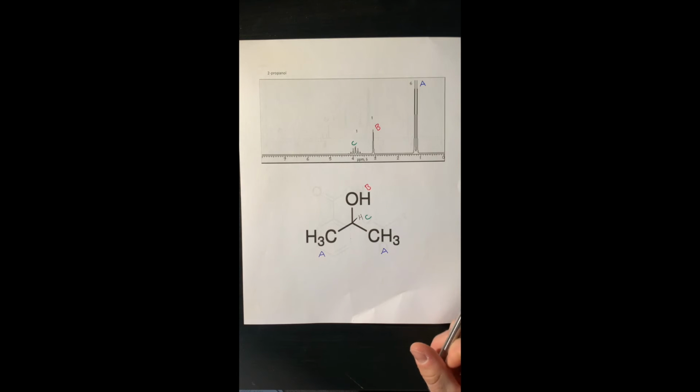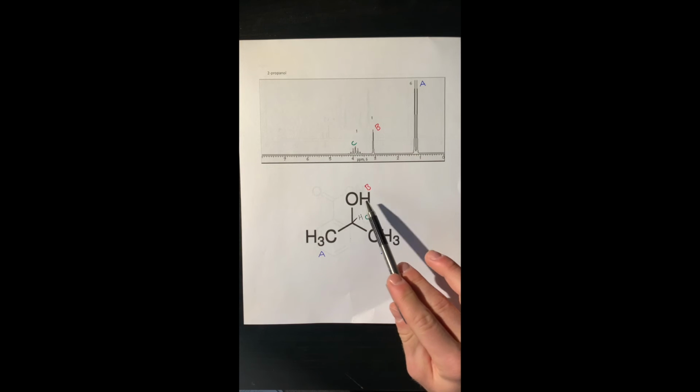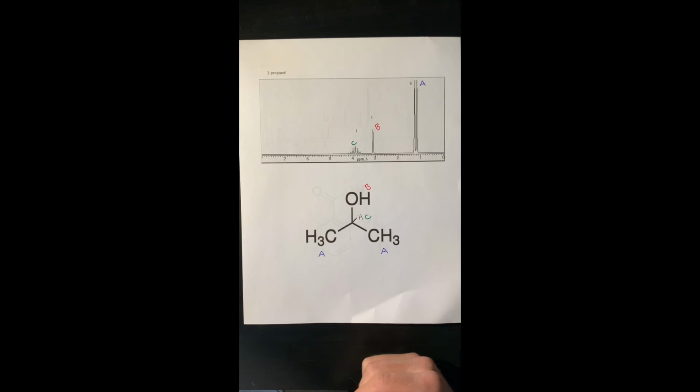So the hydrogen attached to the oxygen in the alcohol is the only hydrogen in this molecule that is not bonded to an atom with adjacent hydrogens. And that means that this hydrogen right here will give us a singlet. And so, like I said earlier, alcohols can be between 1 and 5 ppm, and this one is hanging out around about 3 ppm. But because it's a singlet, you can tell that it's the alcohol. It's also a little bit more broad than the other peaks.